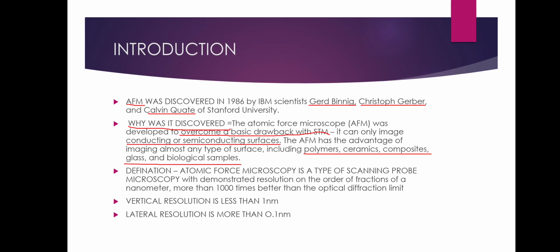Now, the definition of atomic force microscopy states that it is a type of scanning probe microscopy which demonstrates resolution on the order of a fraction of a nanometer, more than 1000 times better than the optical diffraction limit.